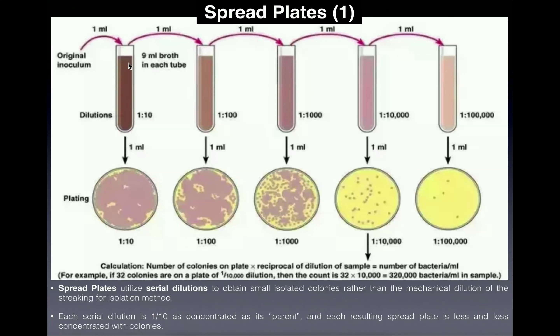Even at one-tenth concentration there would still be way too many bacteria on the plate, so we need more dilutions. We take one milliliter from this first dilution tube and transfer it into a new test tube, then add nine more milliliters of blank TSB, again bringing the final volume to 10 milliliters. This solution is one-tenth the concentration of the first dilution, which was already one-tenth of the original — so this is one one-hundredth of the original. But plating this still gives too dense a result, so we keep making serial dilutions.